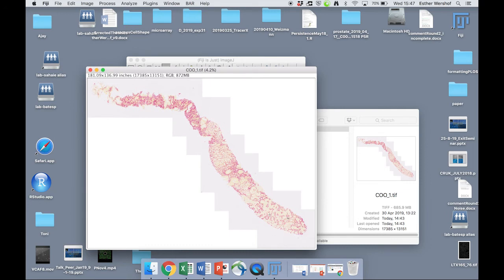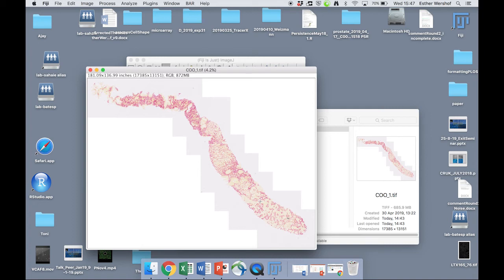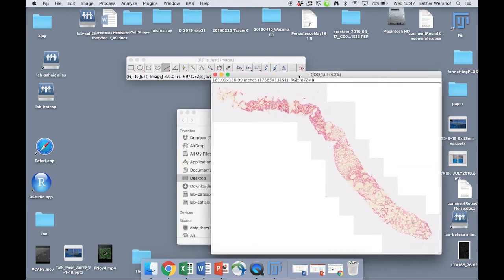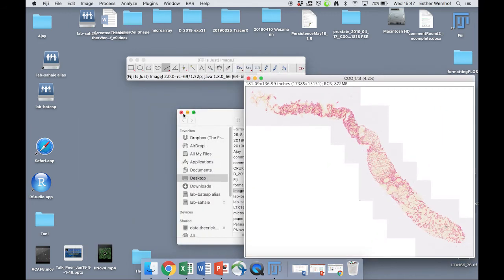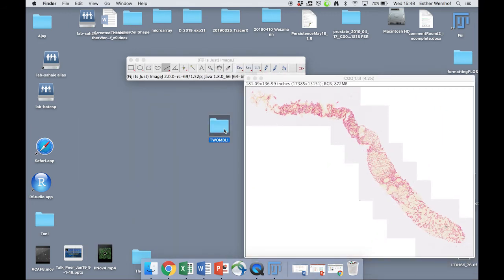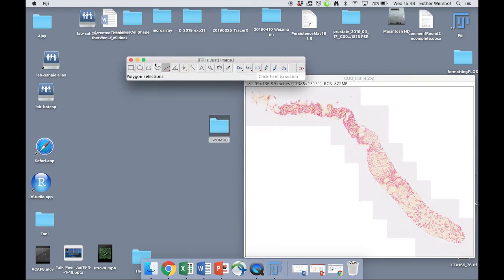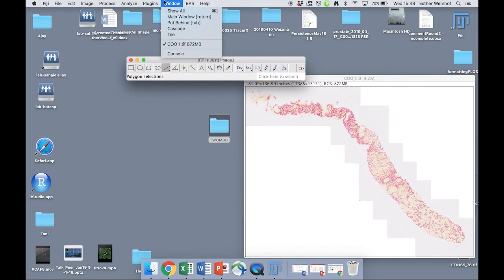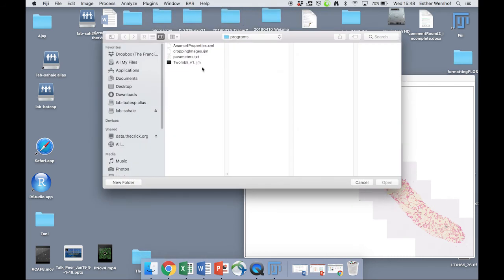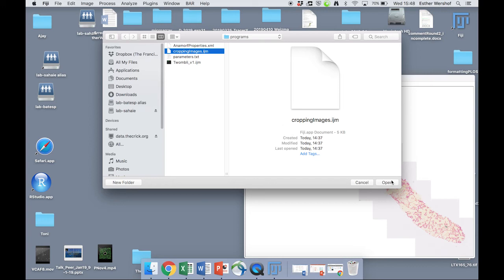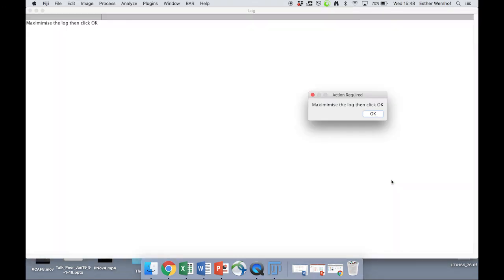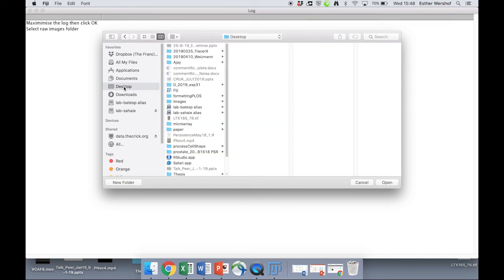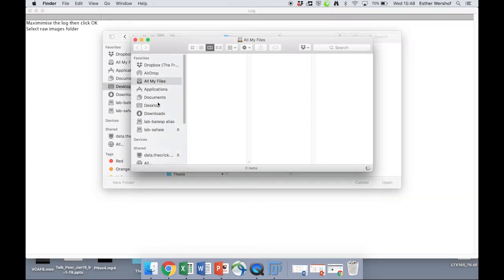We might only be interested in actually analyzing specific areas. If this is the case, there is also another plugin inside the Twombly folder. So if we go to plugins, macros, run, we have this additional plugin called cropping images, which kind of does what it says on the tin. Again, we're asked to maximize the log. We're asked to select an input folder. So let's just say in our desktop, it was in images.